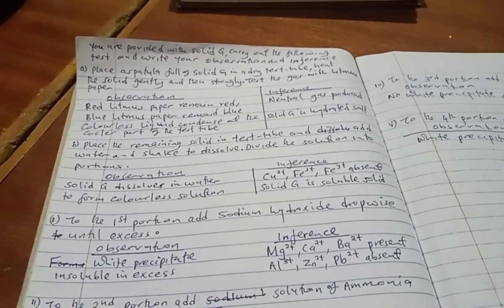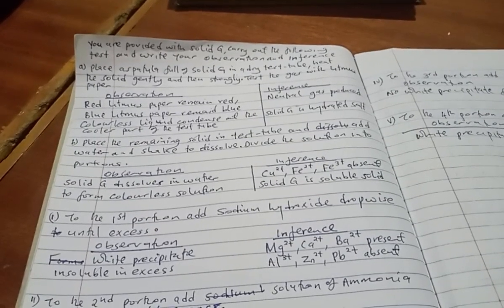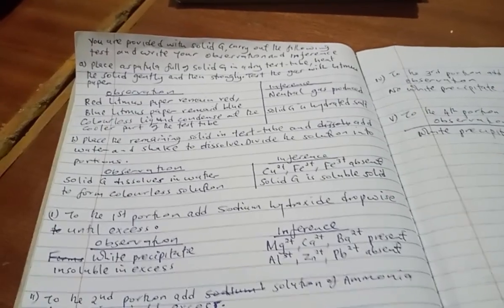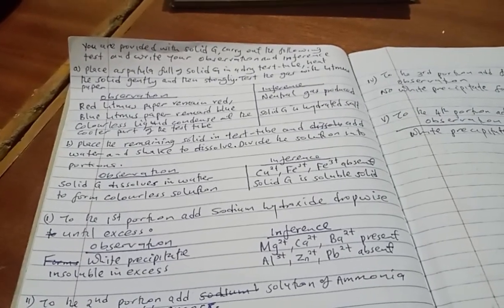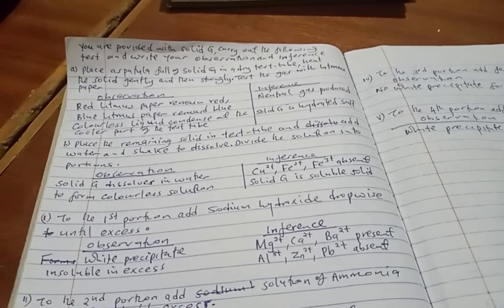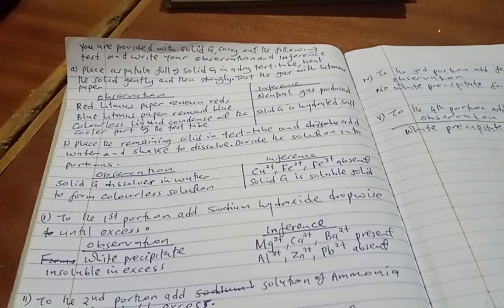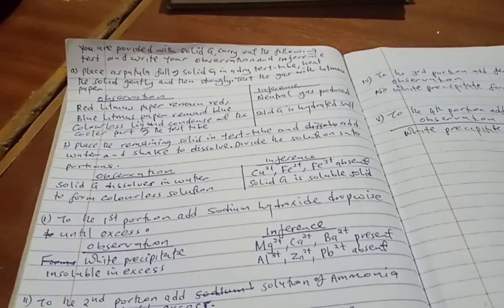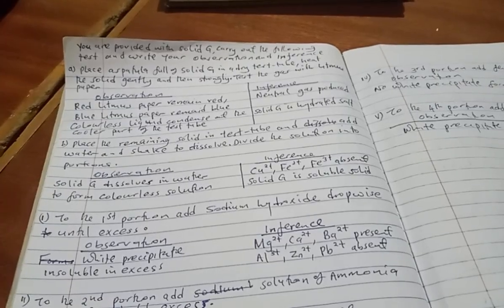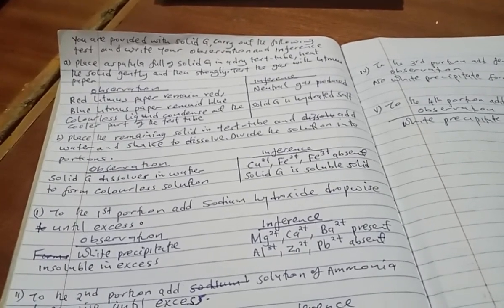You are provided with a solid, any solid. In this case I've chosen the first letter of my name, Gabriel, that is G, to carry out the experiment and write observation and inference on it. So experiment number 1: you place a spatula of solid G in a test tube, heat it gently and then strongly. Test the gas with litmus paper.